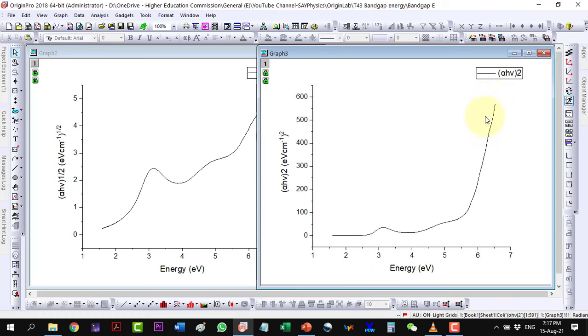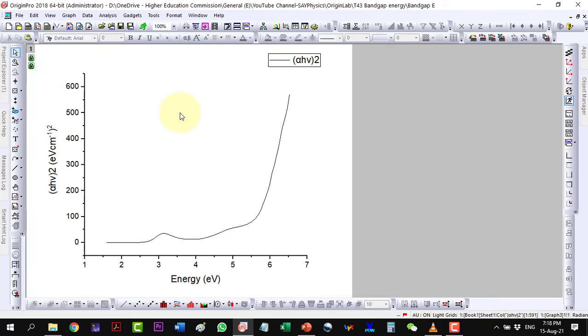Here we can see that the square term shows the best fit for the linear region extrapolation. So let us focus on this one.